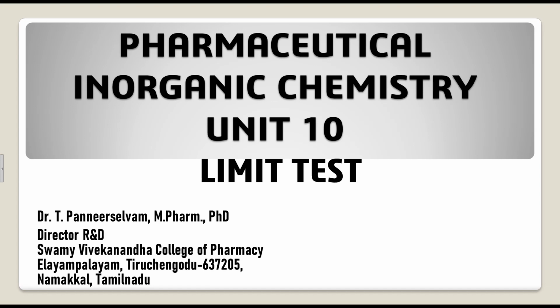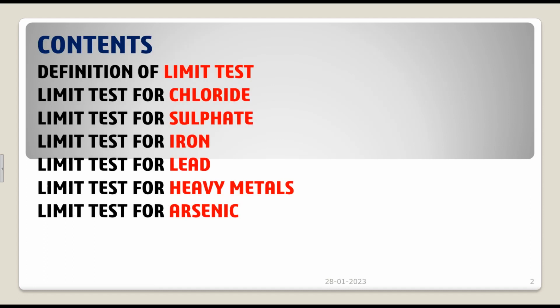In this video, we are going to see about pharmaceutical inorganic chemistry unit 10, that is limit test. Under this unit, we are going to cover the following contents: definition of limit test, limit test for chloride, sulphate, iron, lead, heavy metals, and finally limit test for arsenic.